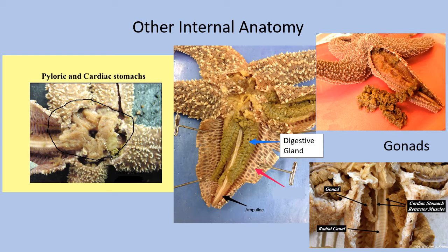On a dissected sea star, they're very difficult to tell apart, so you can just think of that as a stomach. And it's a very squishy, fibrous tissue that's difficult to remove in a dissection. But the stomach would sit on top of the ring canal area, so you wouldn't actually be able to see the ring canal without first removing the stomach in the middle.